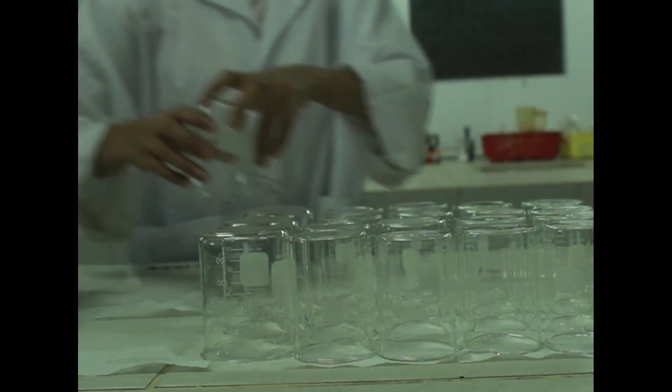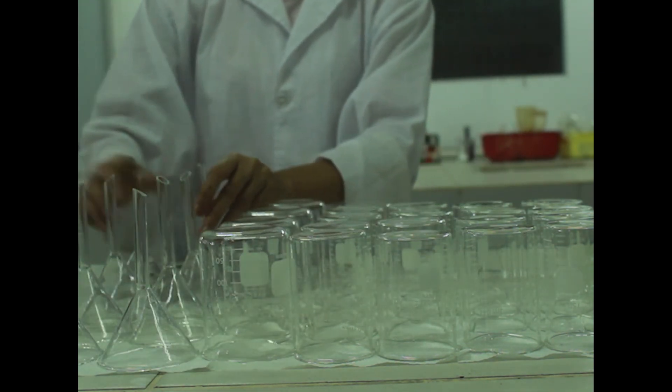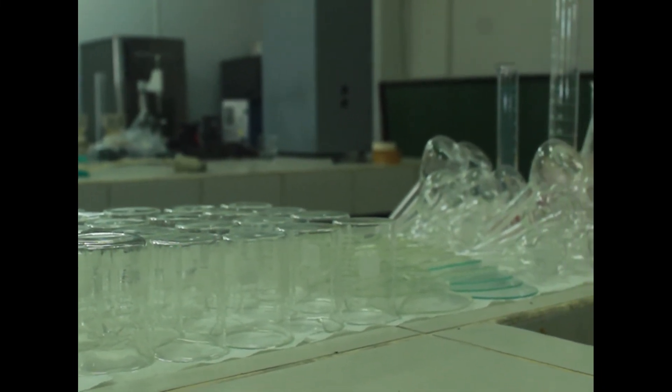Usually one batch of digestion takes up to two to three days. So when it starts to get dark, I set them all aside, pack up, and continue the process on the next day.